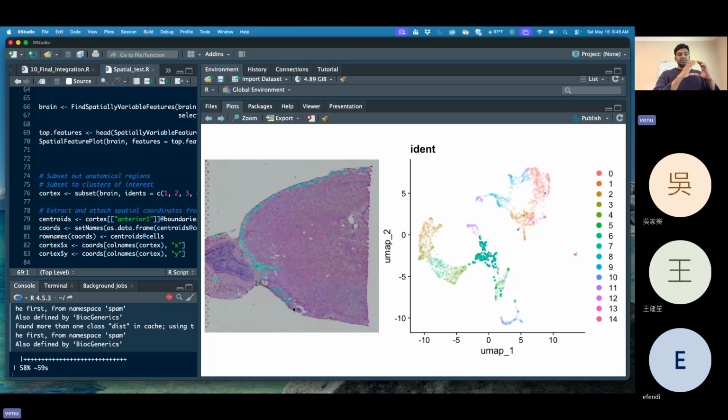Suppose a circle is 100%, and 60% of one kind of marker shares the gene expression. If we take 1,000 genes in a single spot, 600 genes are highly associated with one cell type, like epithelial. This is the outer layer, epithelial. But there are also 400 markers expressed, not as much, from another. That is called neighboring. Within the spot there are neighbor cells.